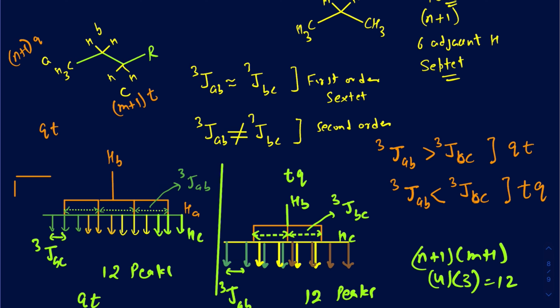And remember, typically we call those a multiplet because it's just so hard to kind of decode those, and especially sometimes in sophomore organic chemistry, they don't bother trying to figure out the coupling constants too much. But every now and then you may run into a scenario where you're actually worrying about the coupling constants and the number of peaks in this particular case.